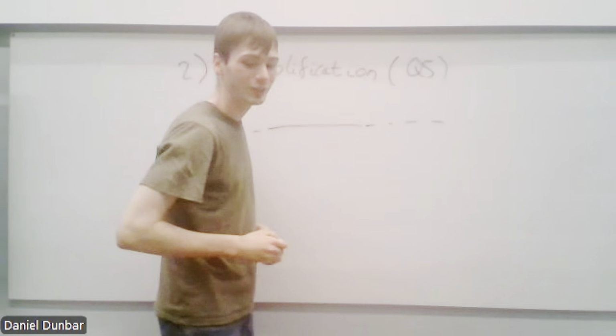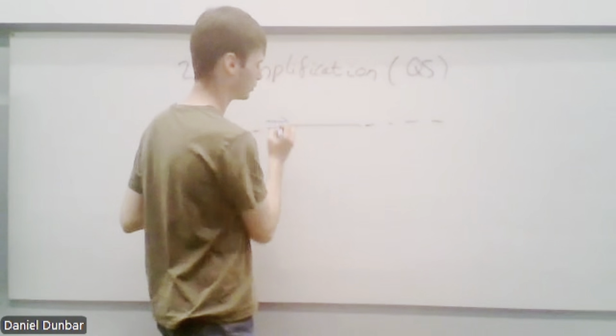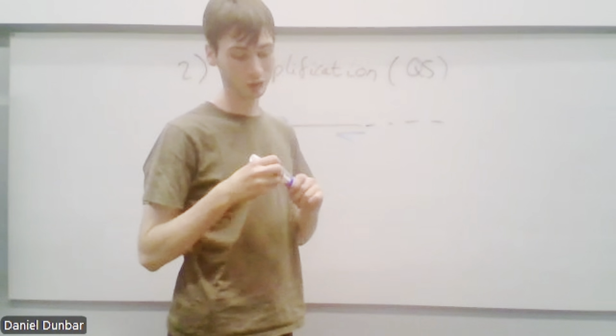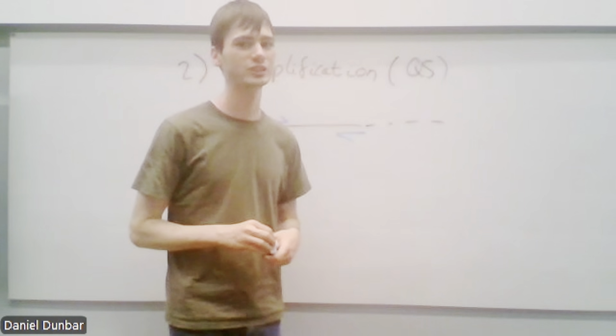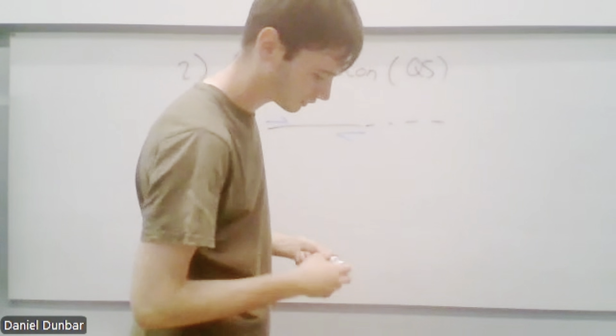So amplification is quite simple in theory. Your primers just sit on either side of the sequence you want. They amplify it up. Bob's your uncle, you've got it. However, since amplification is usually for cloning, we have to analyze what the primer sequences actually look like.